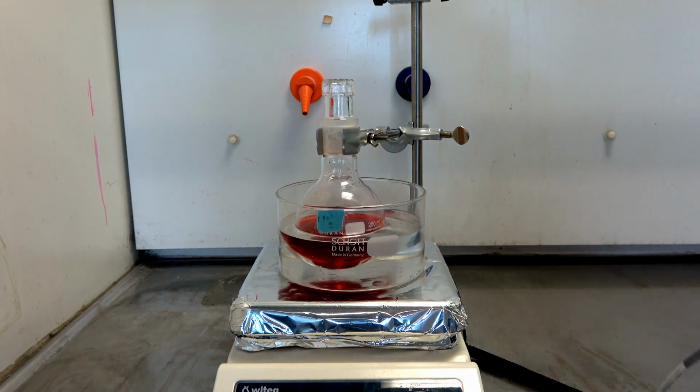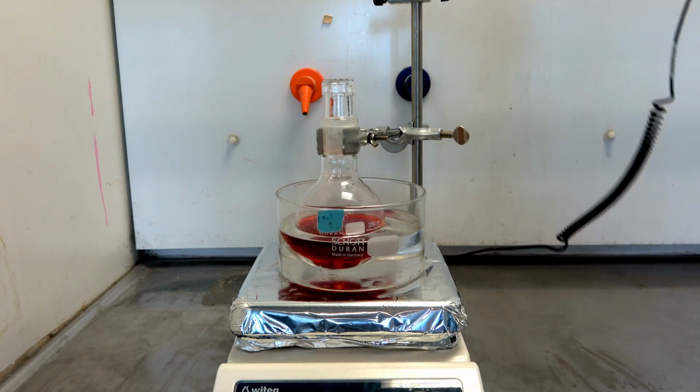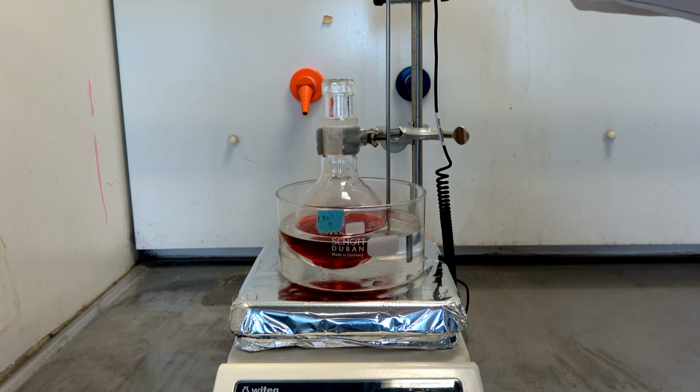The temperature can also be controlled by a heating probe. If a probe is being used, it is crucial that the probe remains immersed during the whole heating period to avoid accidents.